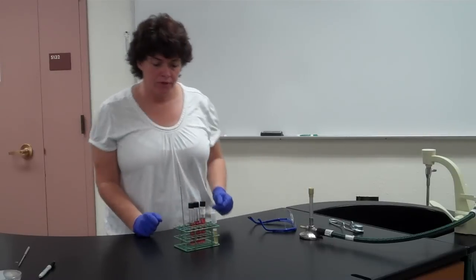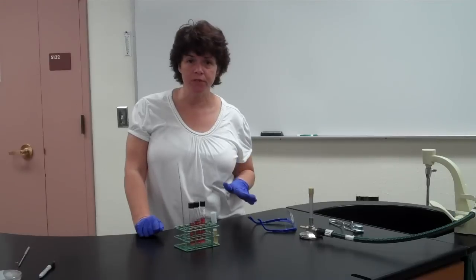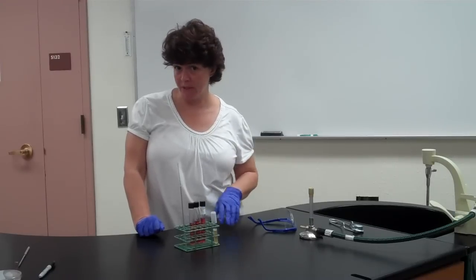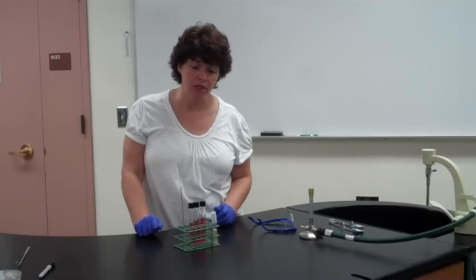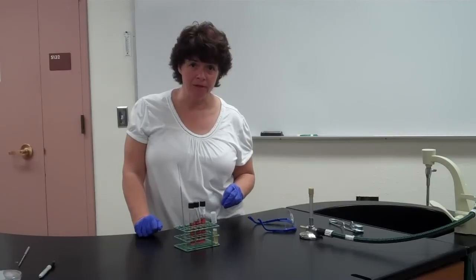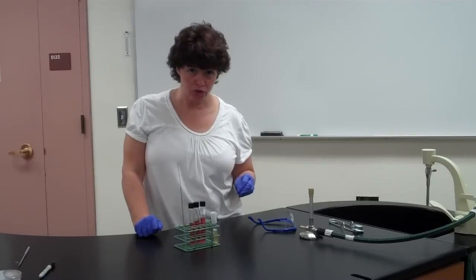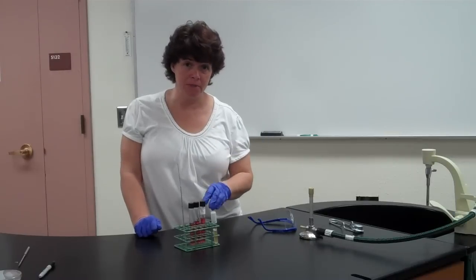The second lab that you're going to be doing is associated with carbohydrates. The first one we did had protein, starch, and possibly lipid hydrolysis. Now we're going to look at carbohydrate fermentation. In this case, you're going to have an enzyme that works within the cell, breaking down particular sugars, and then it puts off a byproduct that you can measure in the media.